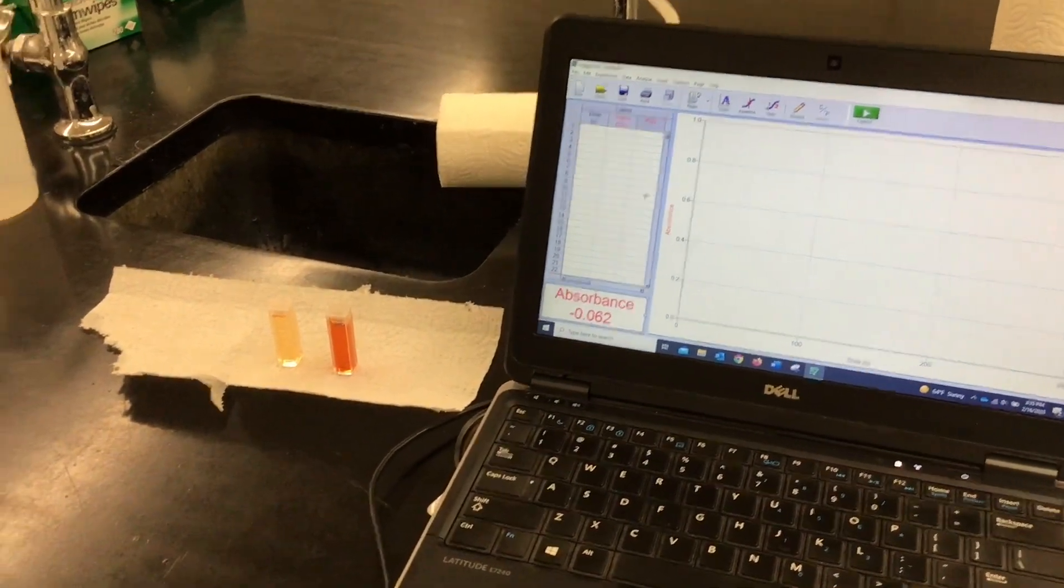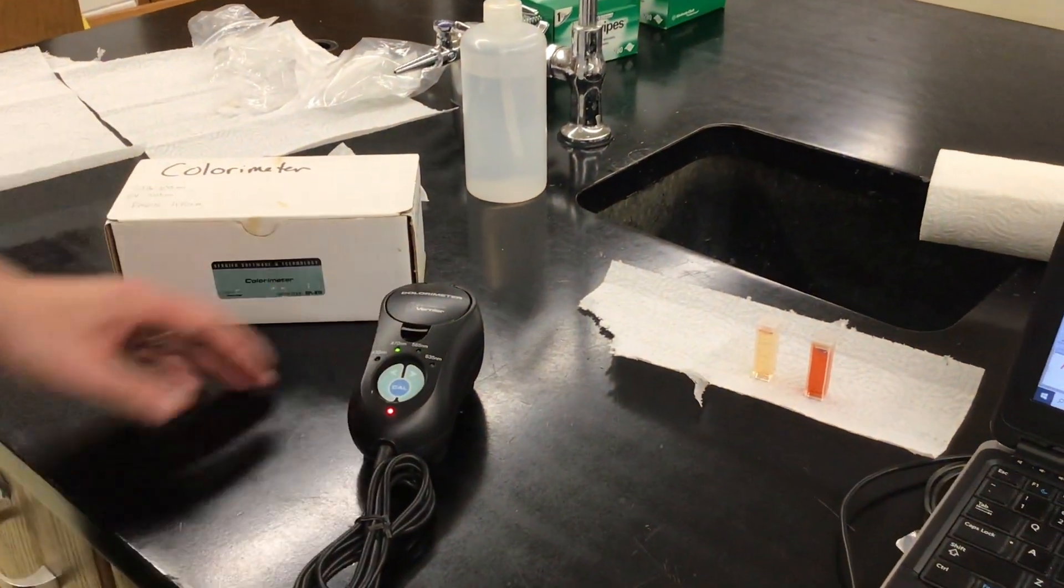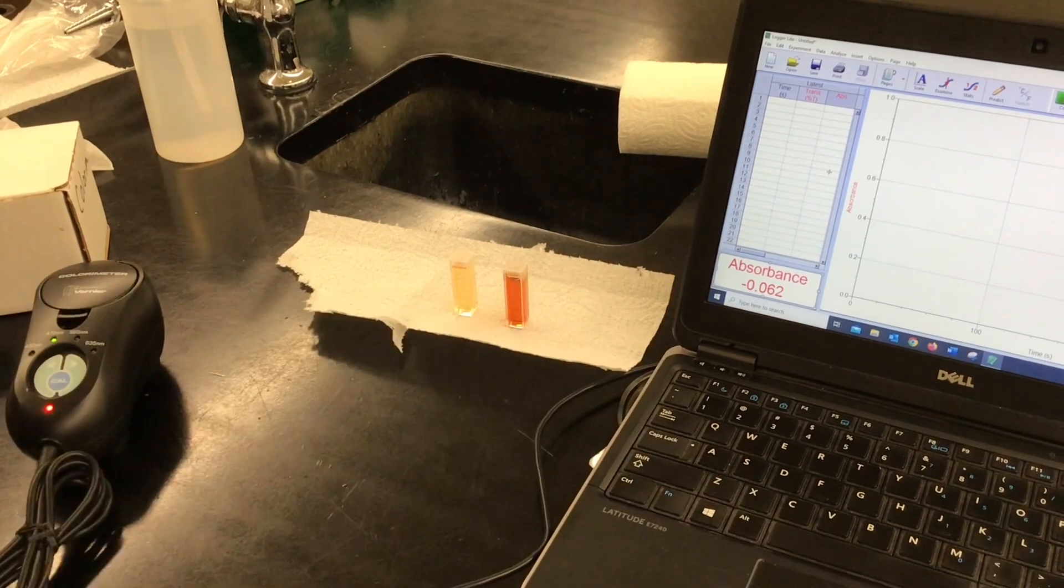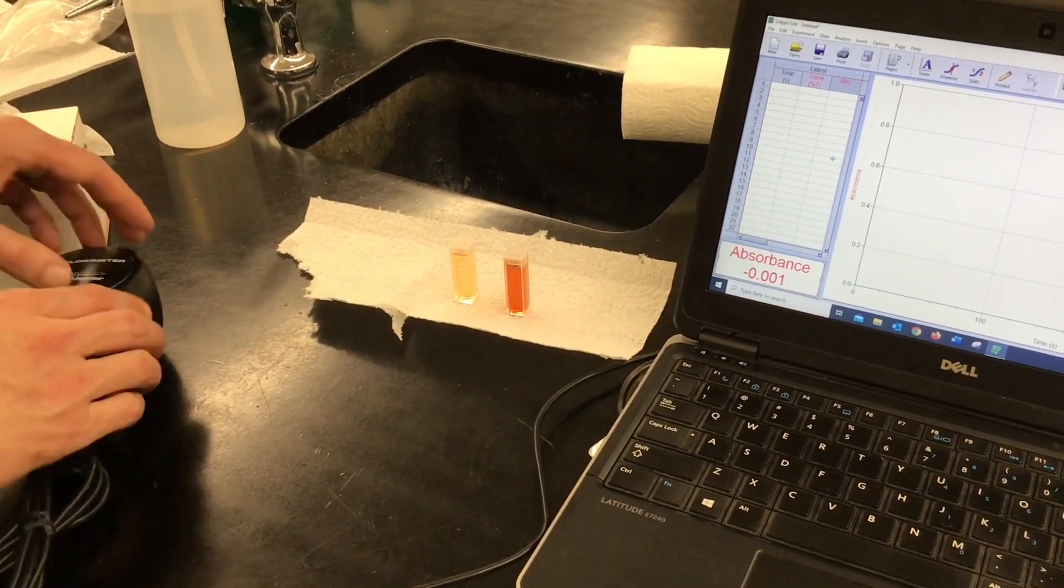Okay, so right now I've got the absorbance. It is going to be standardized, so I'm going to press calibrate because I have a water solution in there and it should read close to zero. I'll have to let this warm up. There it goes.